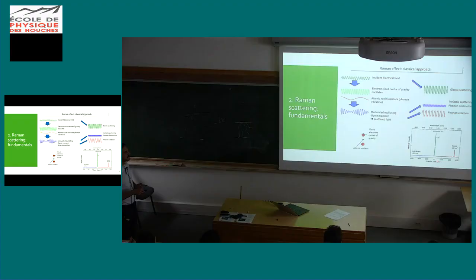And to give you an idea, for every 1 million photons created elastically, just 1 photon is created inelastically. So this is the complexity of Raman spectroscopy: we have to identify this signal among 1 million photons that are created elastically. So it's for that reason that you need a special optical setup, a special laser for Raman spectroscopy. The same setup that is used for photoluminescence most of the time is not useful for Raman. But nevertheless, if you have a Raman setup, you can use it for photoluminescence without problem. And also because this energy difference is very small. So this peak is 1 million times more intense than this, which is the Raman peak, but the difference could be 40 millielectron volts, 30 millielectron volts normally in common materials, so it's nothing.